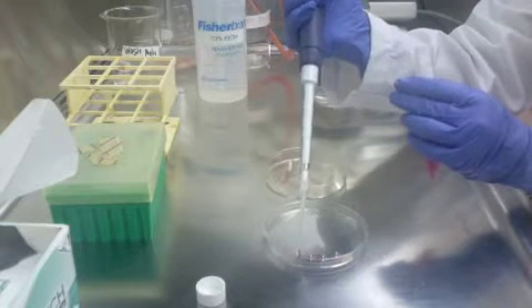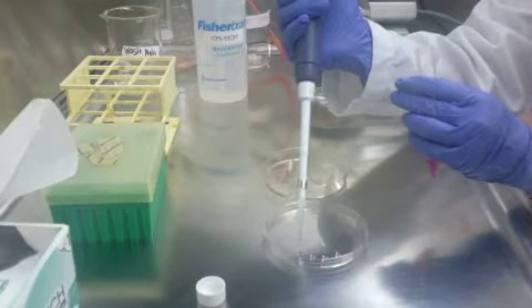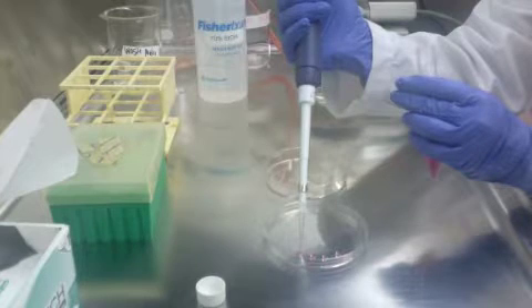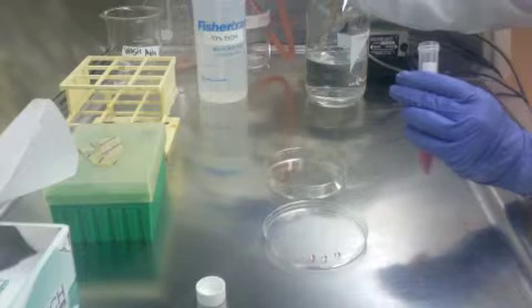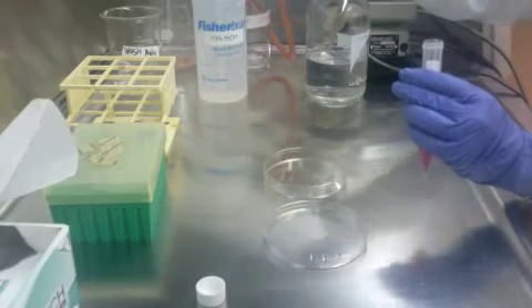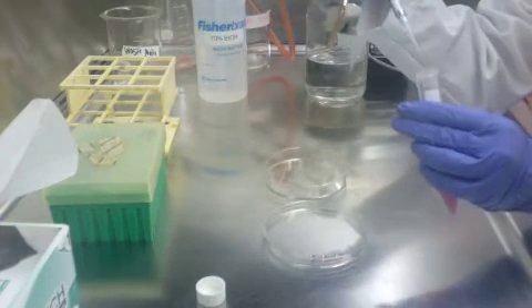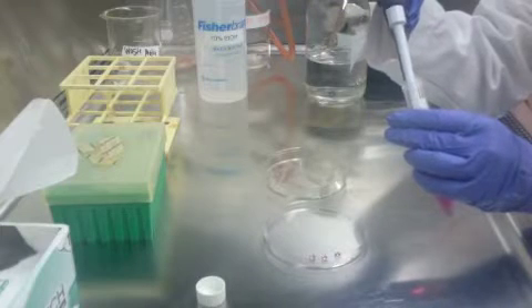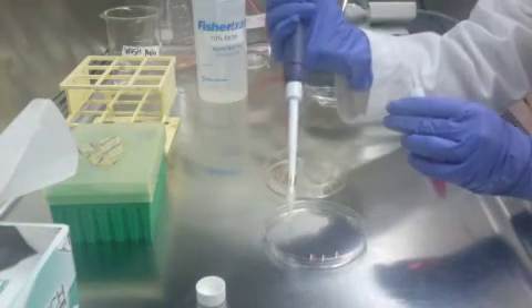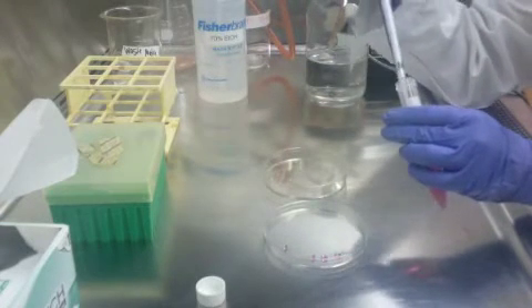If you have a drop that does not form, go ahead and pipe out the drop and dispose of it. Make sure not to add another drop where that wet spot was, or else your new drop will not stick. Then just continue the same process setting your drops.